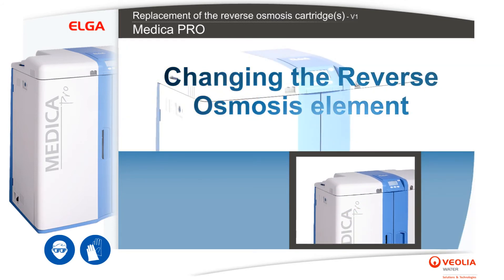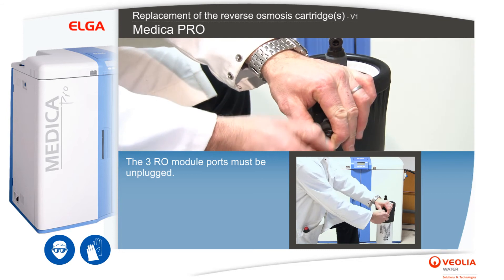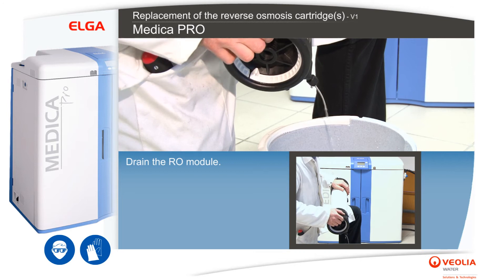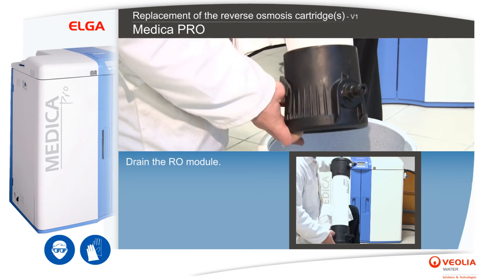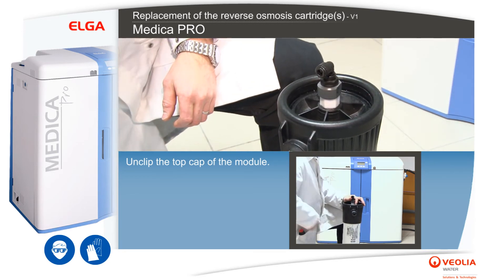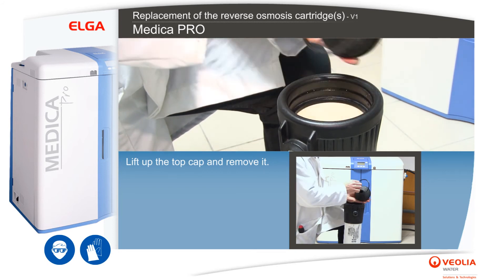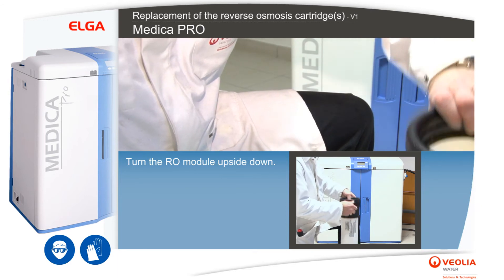Changing the reverse osmosis element. Take a large flat screwdriver. The three RO module ports must be unplugged. Drain the RO module. Unclip the top cap of the module.